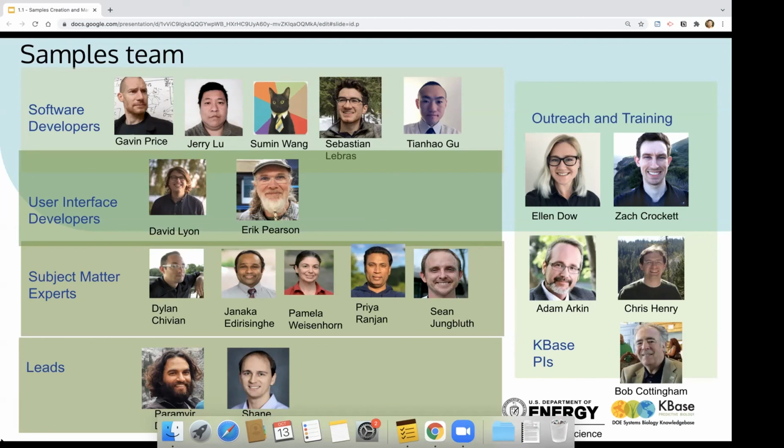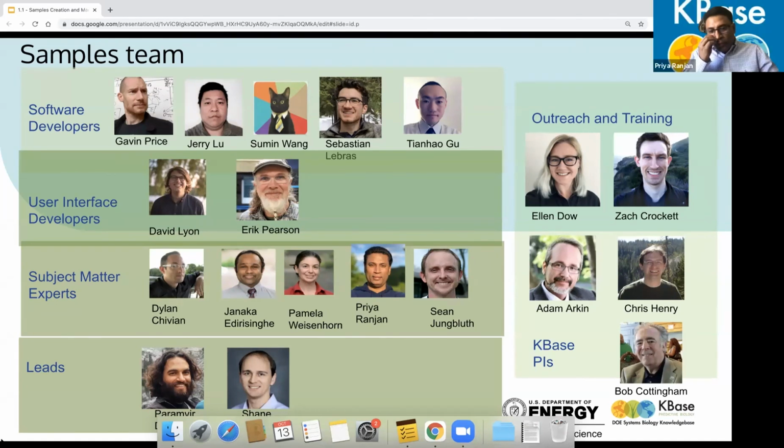Yeah, I see there are some more questions in the document. Someone asks, it sounds like there's ongoing work to map from INSDC biosample. Does that include GSC MIxS terms? Yeah, so for the NCBI biosamples, we will support MIxS templates, but if there are specific MIxS templates that you're interested in, reach out to us, let us know, and we can prioritize those.